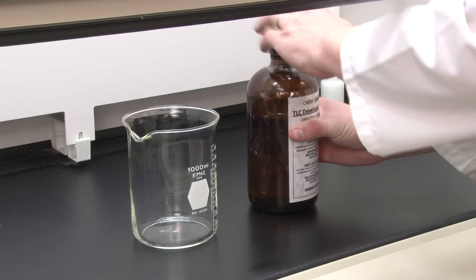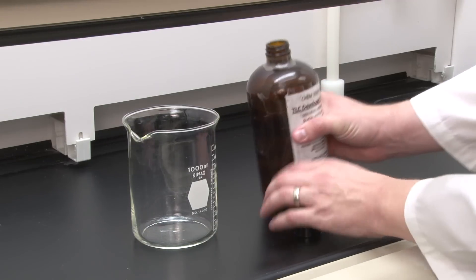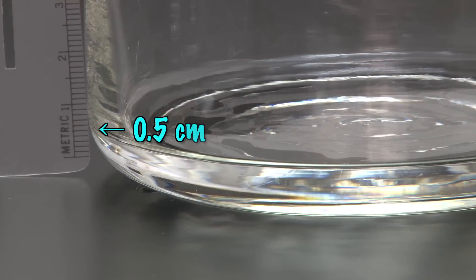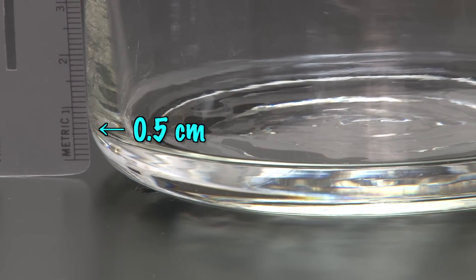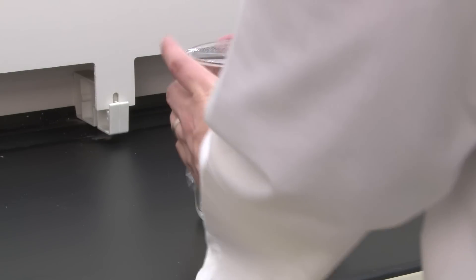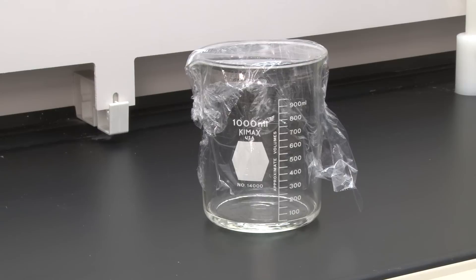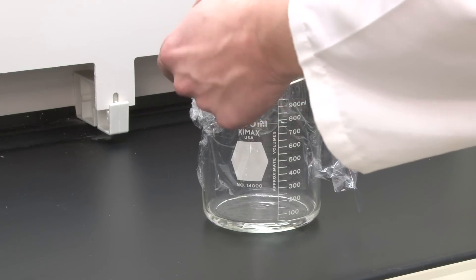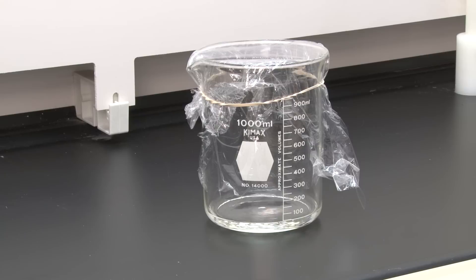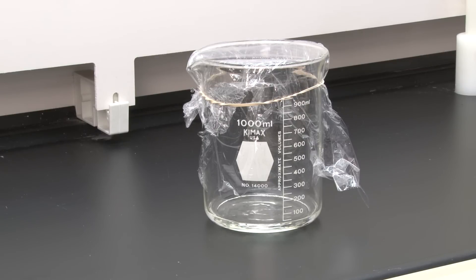First, you'll prepare a developing chamber under the hood by pouring a pre-made developing solvent mixture into a 1-liter beaker to a depth of about a half a centimeter. Cover the beaker with plastic wrap or a large watch glass. When the container is airtight like this, the solvent vapors will fill the chamber, and the developing process later will work much better. Set the chamber aside under the hood for later.